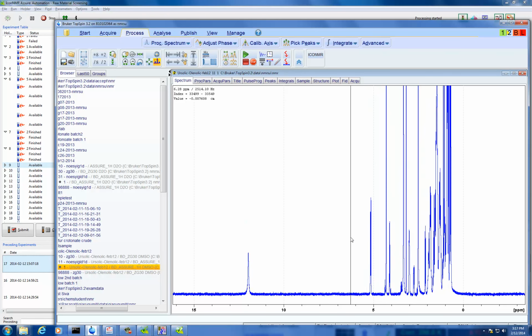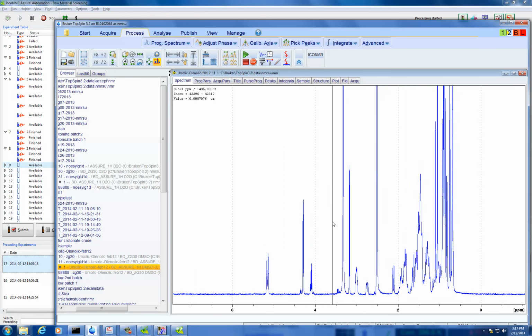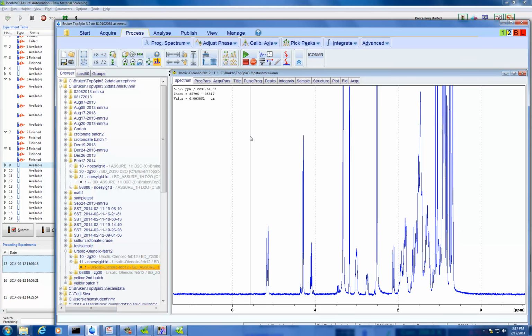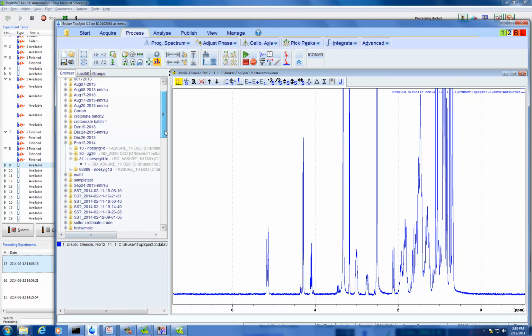So that's the sample you just put in. I can just print that just to see, compare with the previous one. You want to compare it, or you want me to print it? It'll be saved then. I can print it anytime, it's saved in the data on the hard drive. Okay, then no problem. I mean, what is this? This is a mixture again.